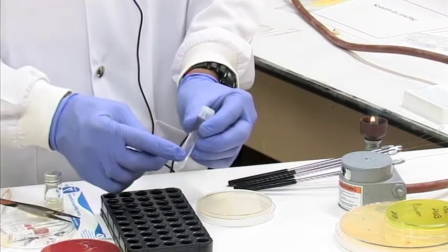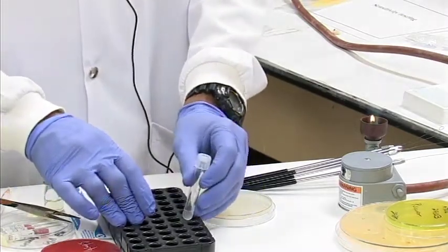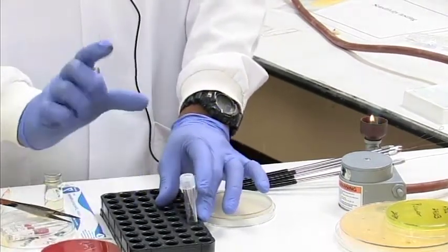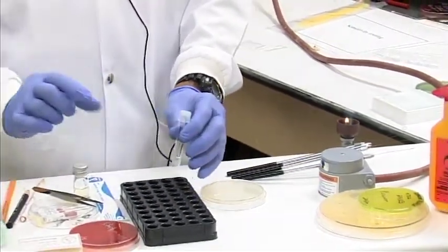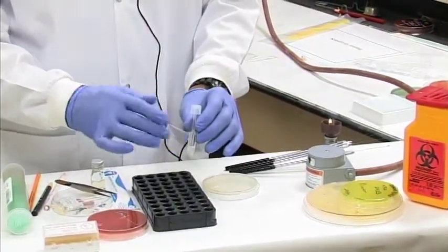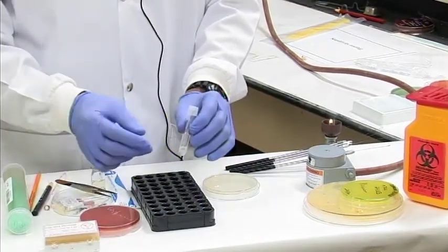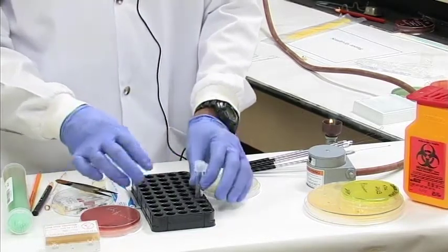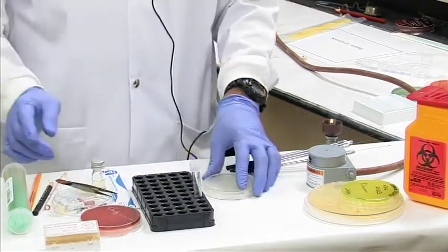We have to compare this now to a standard called a McFarland standard, which is a 0.5 McFarland standard. The 0.5 McFarland standard must be the same density as this. So we'll take our standard tube and compare it to make sure it's the same strength or turbidity. Once it's set, if it's too light, you can go back and add more bacteria. If it's too heavy, you have to decant and add some more saline to the tube to get it to the same density.